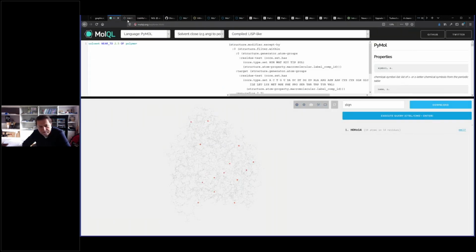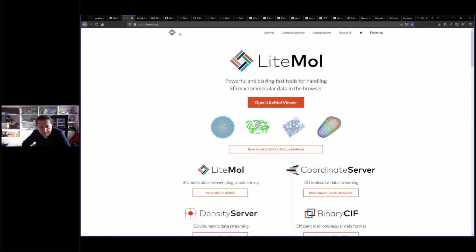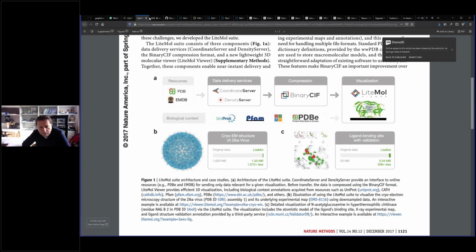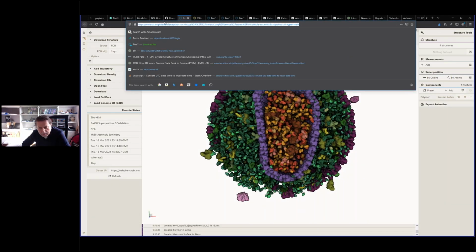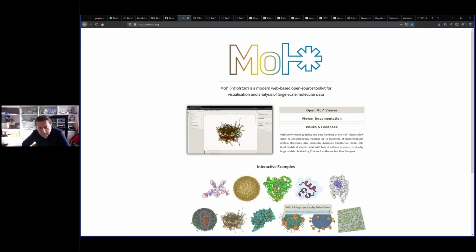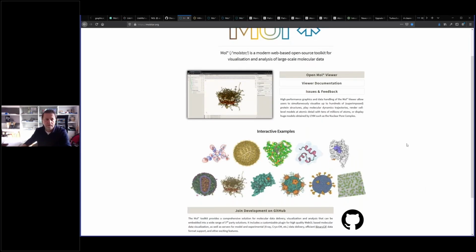Okay, so it also depends on which viewer. The animations here run best in Chrome, and this one is Firefox, and I have a very high-end PC. I have the latest Ryzen and GeForce 3000 something, so that's why it is so smooth. But in general, this is as smooth as you can get currently in a browser, even for the older ones.